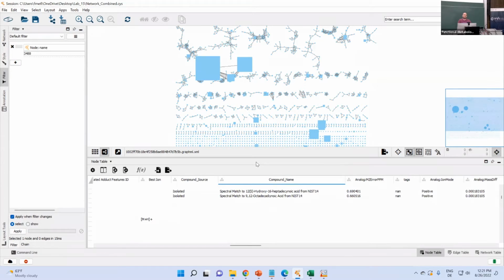How did they get in there at the significant level? That is a very good question. I don't know, but I would assume that because we bought that standard from an algae farm or so as a reference material. I don't know if they have some coatings on their filters for harvesting it, stuff like that. It could have also been in the background in the ocean water, but then it should not have been such a significant difference. But yeah. There's very few typical natural products from Synechococcus annotated.